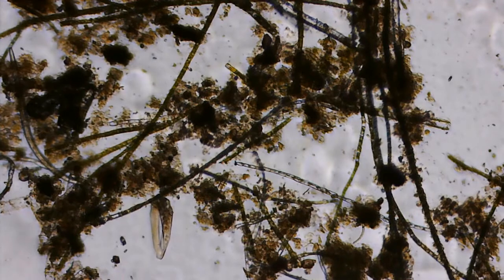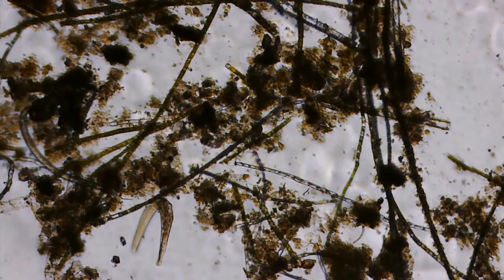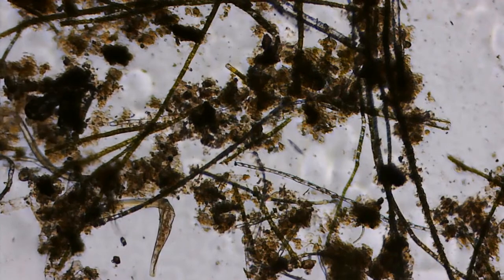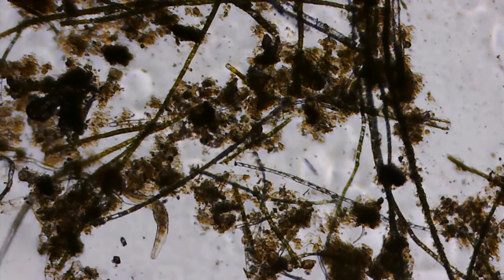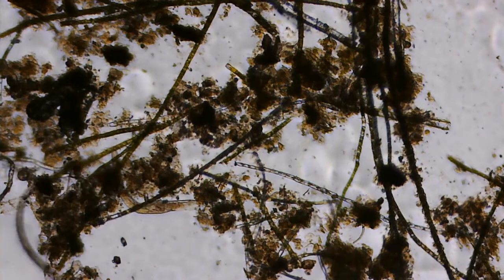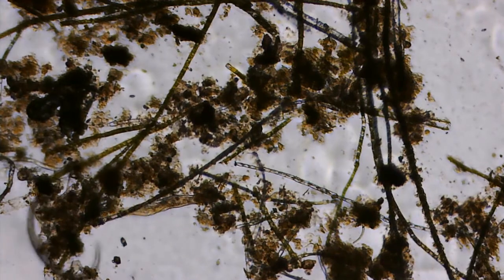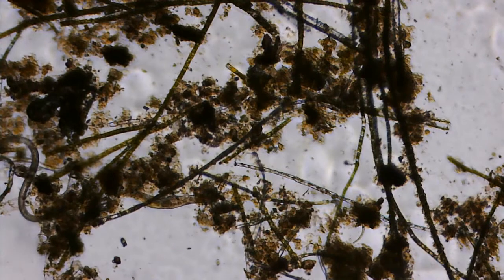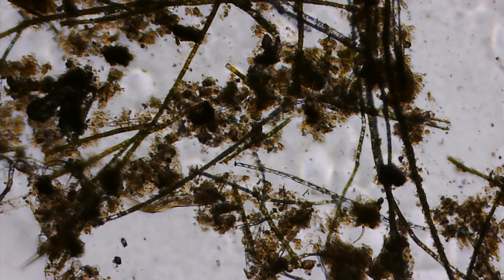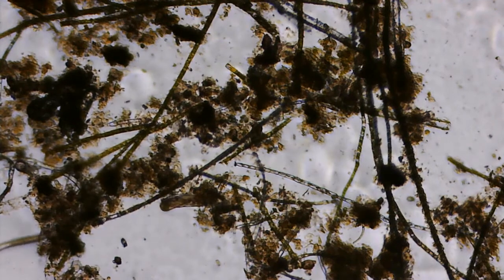But if you look at our spirostomum there at the bottom, you can see it's not a worm. It's got a very flattened end, which is typically where the contractile vacuole is. A contractile vacuole is an organelle held by a great many microorganisms because it's needed to expel unwanted water, which diffuses in normally. A basic fact of chemistry. If too much water were to diffuse into a cell, it would just burst. So they've got to get rid of that.